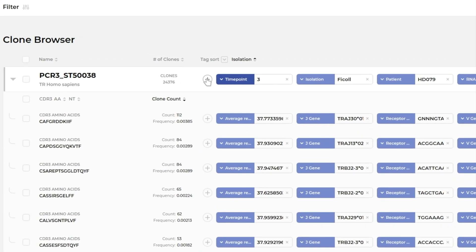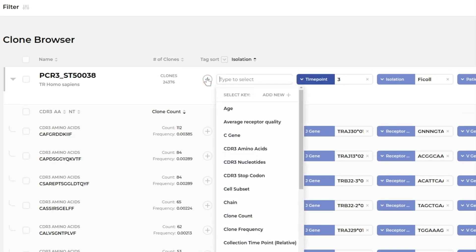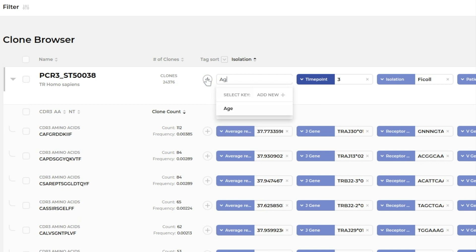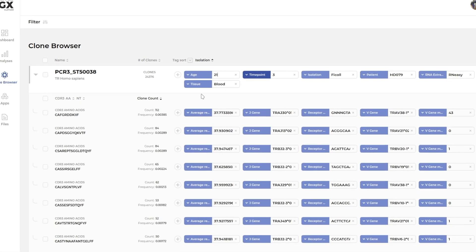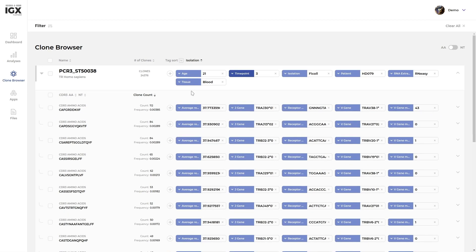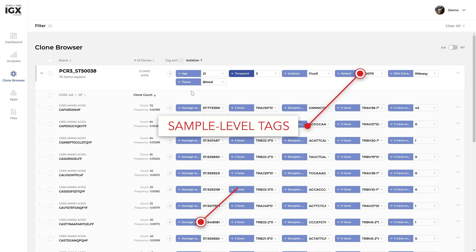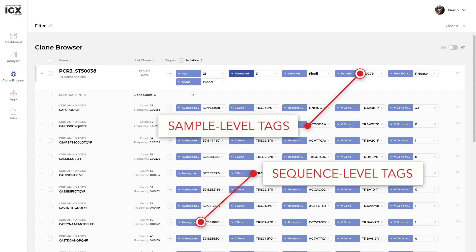To add your own annotation tags, simply click the plus button, select a key, and enter the value. You can associate metadata not only at the sample level, but even at the level of an individual sequence.